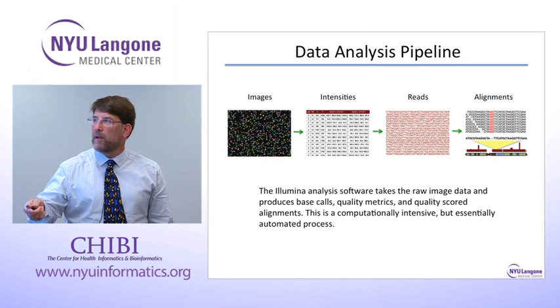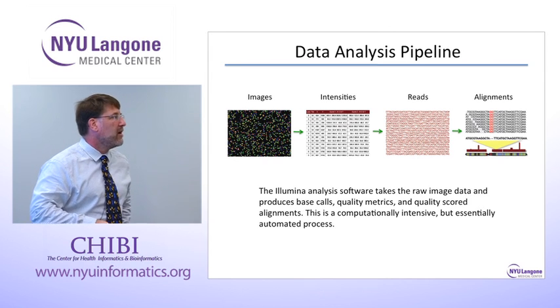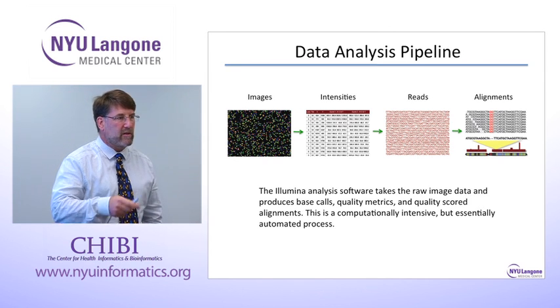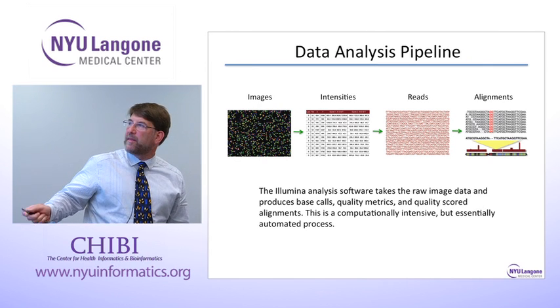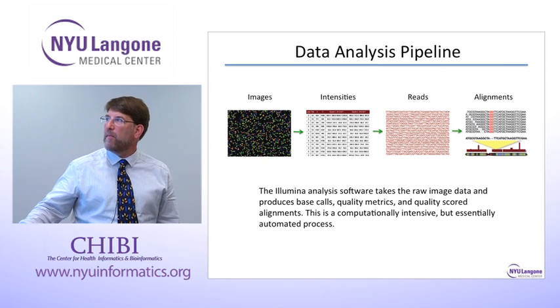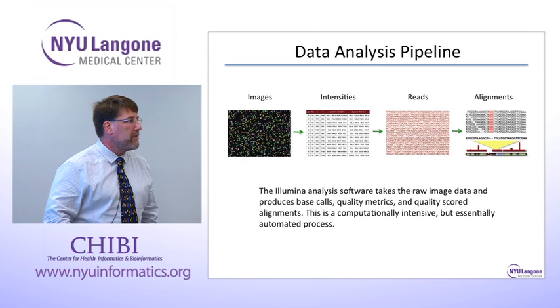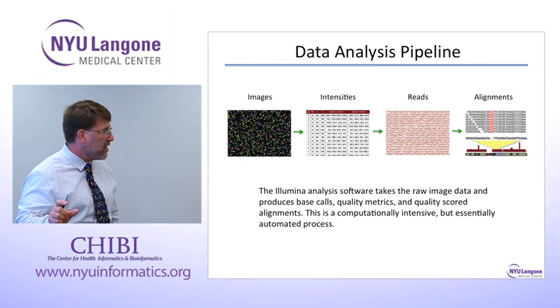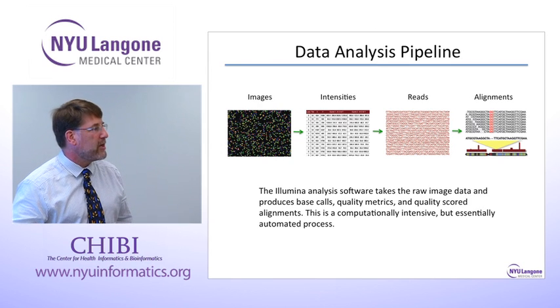You can also do double-ended reads, paired end, read from both ends of a fragment, which is becoming more popular for RNA sequencing. And I'll show some examples of that in later slides. Once you've got the sequence data, then you need to go through a computational step where you match the reads back onto the genome. And that genome probably has an annotation in terms of the locations of exons and introns, which is then computationally translated into gene expression measurements.